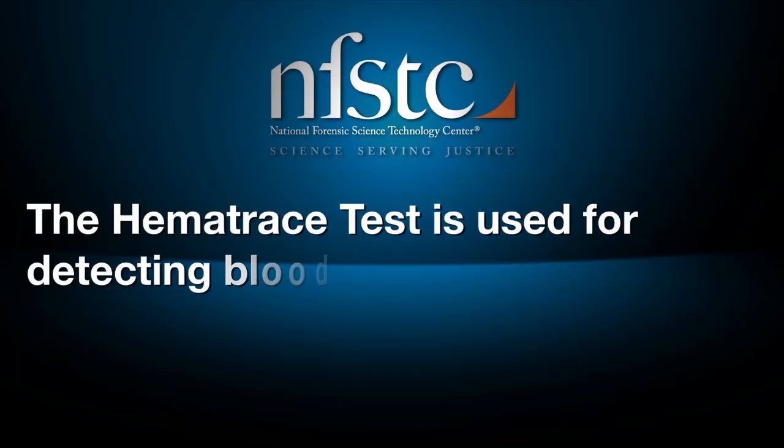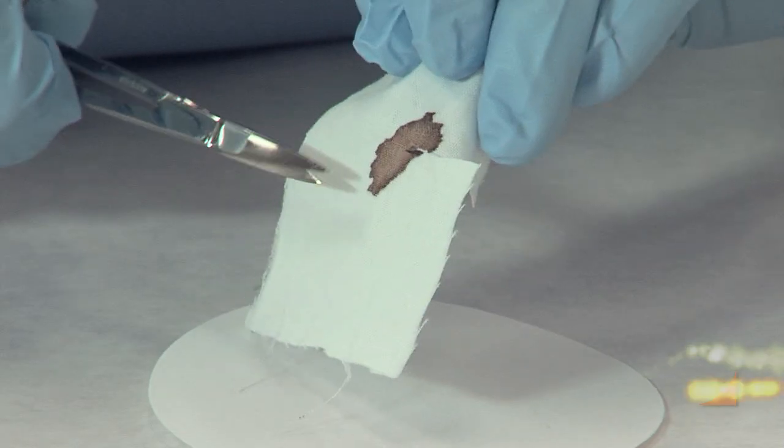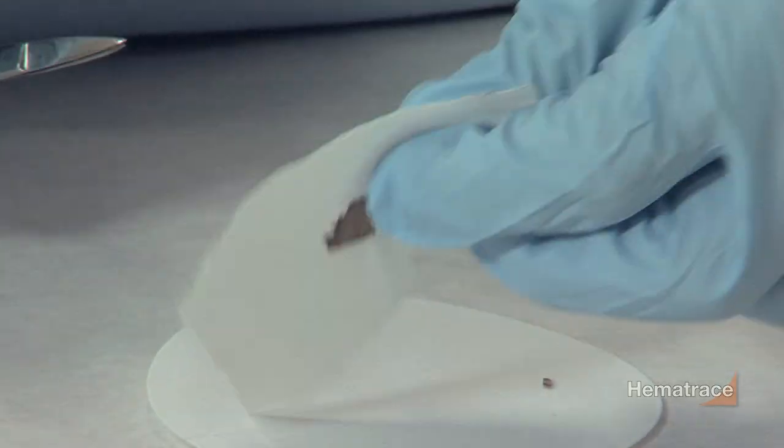The Hema Trace Test is used for detecting blood. Take a small cutting of the suspected blood stain, no larger than one centimeter by one centimeter.